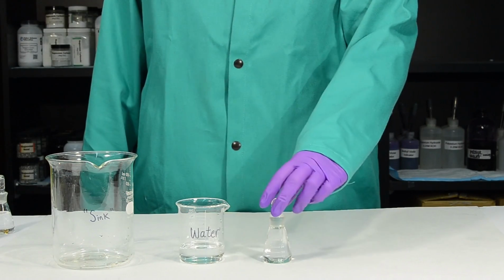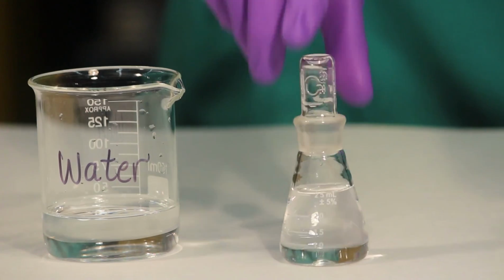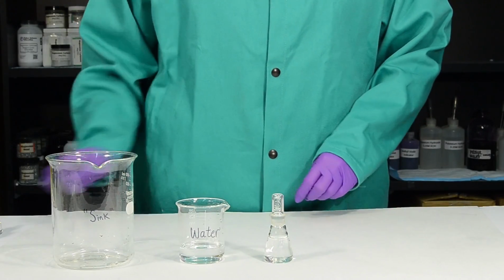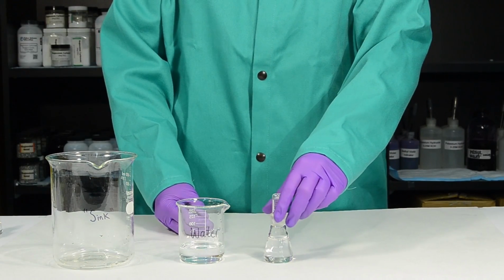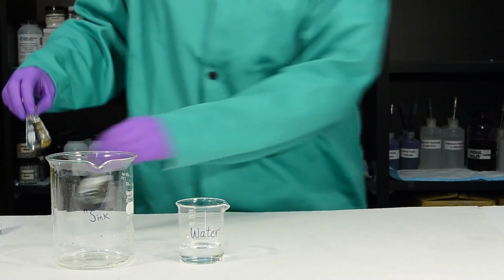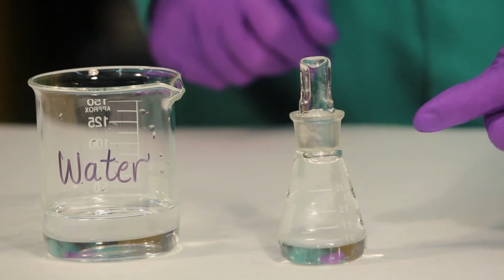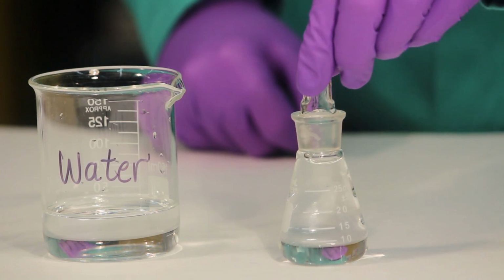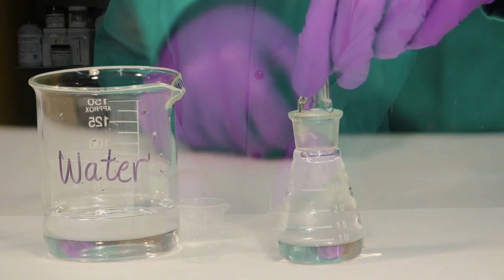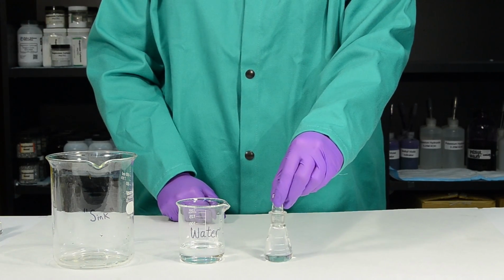A common mistake people make is trying to fill the flask up to exactly the 25 milliliter mark. It is nearly impossible to fill it up to the exact same spot, so that's why we use the displacement method. Another common mistake is leaving air bubbles in the flask. Air bubbles also affect the accuracy of your results, so you should be sure that there are no air bubbles in your flask. Finally, make sure you make all your mass measurements with the stopper placed in the flask.